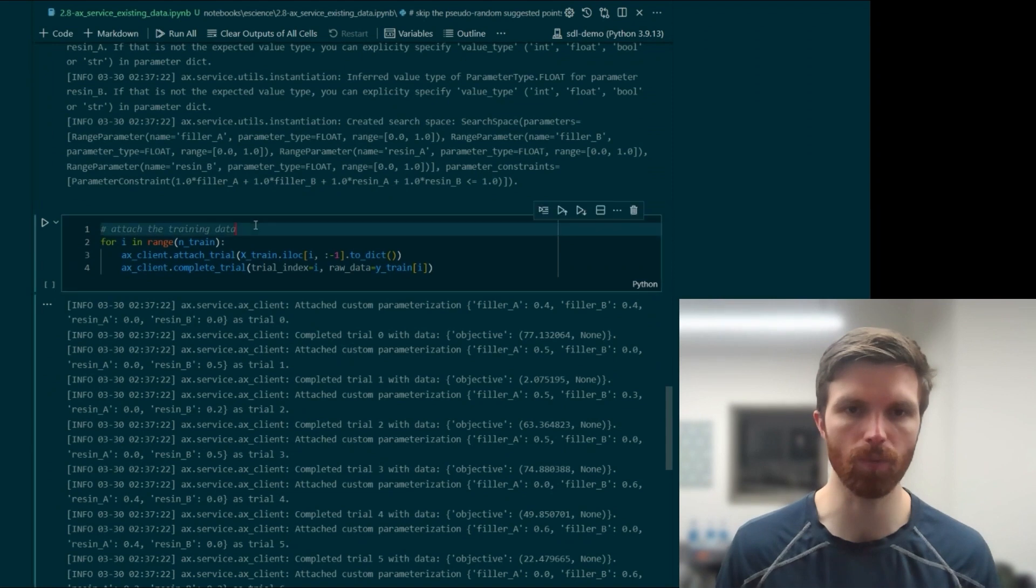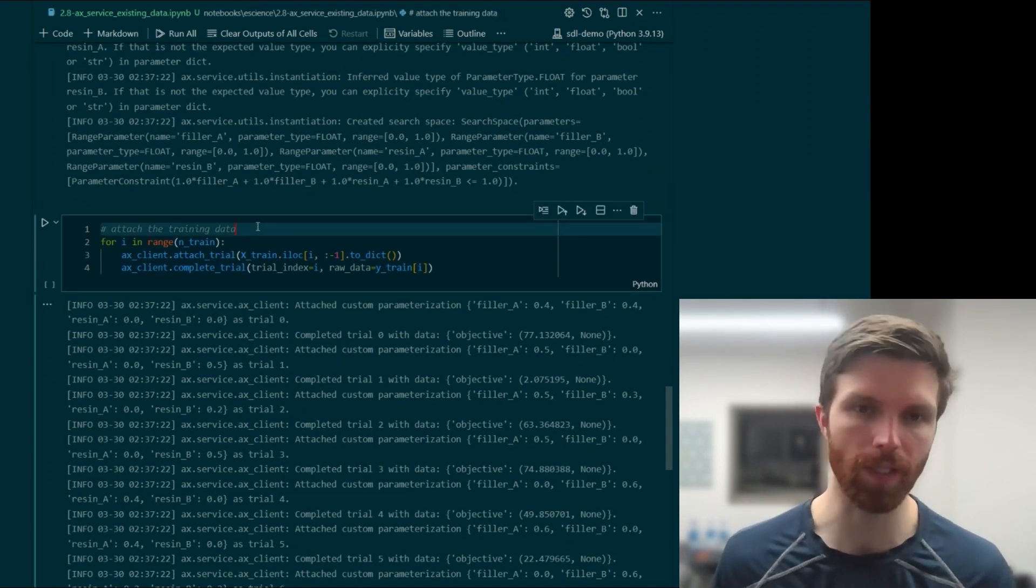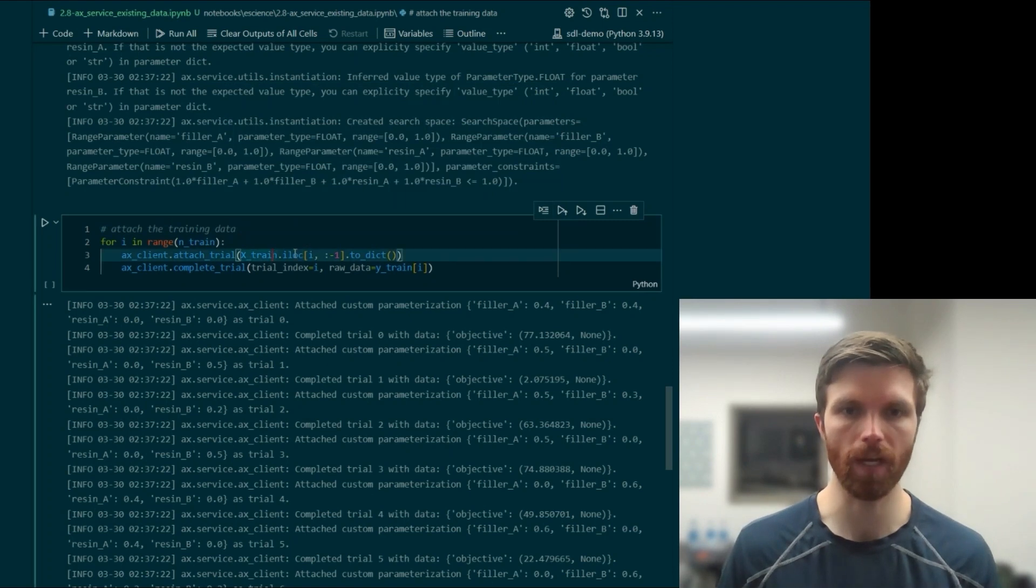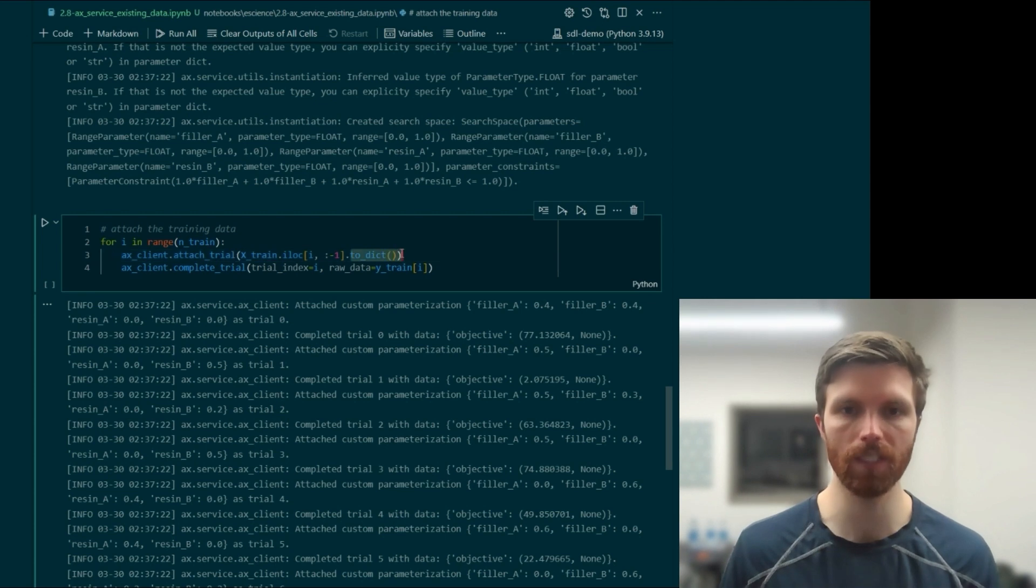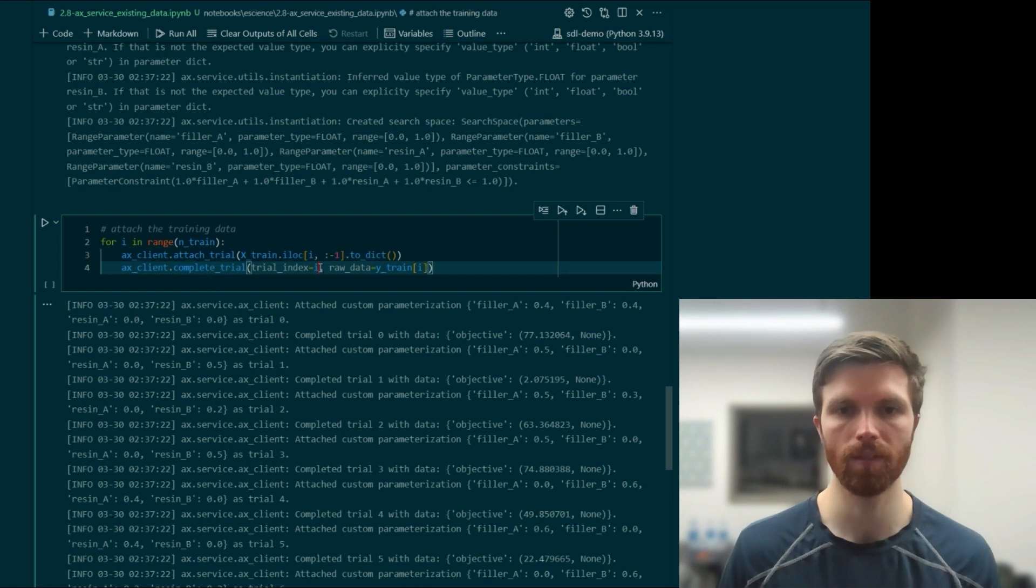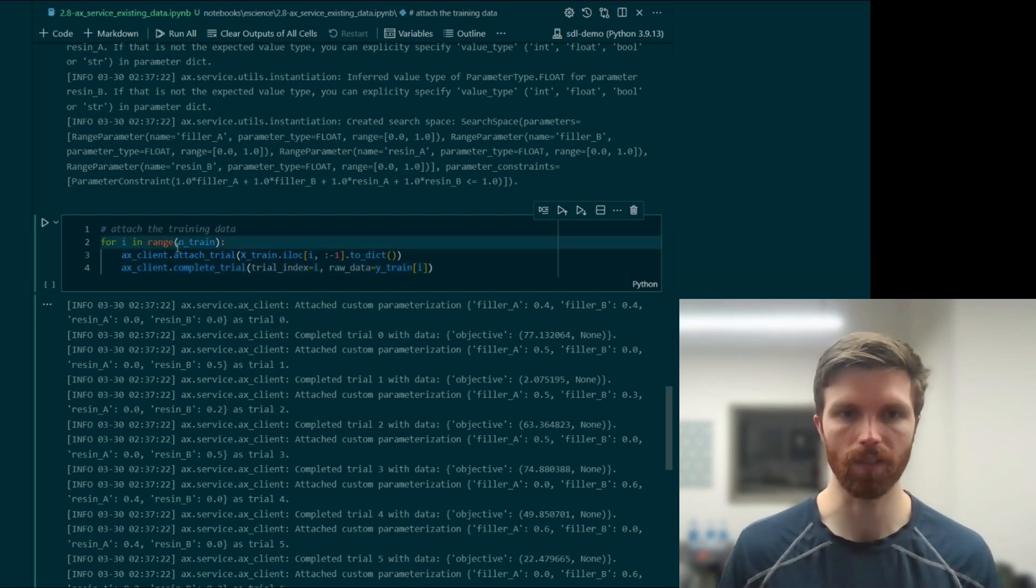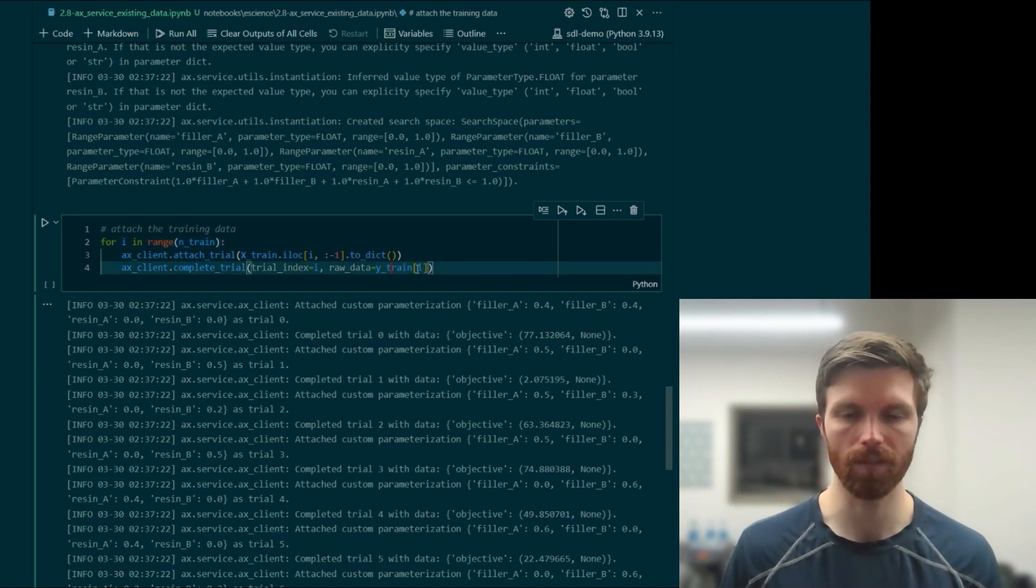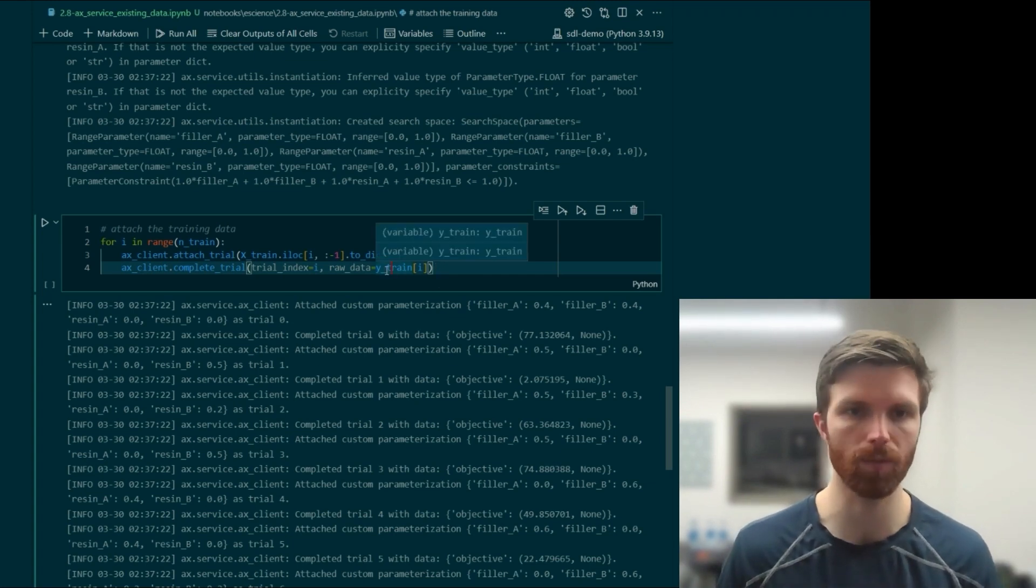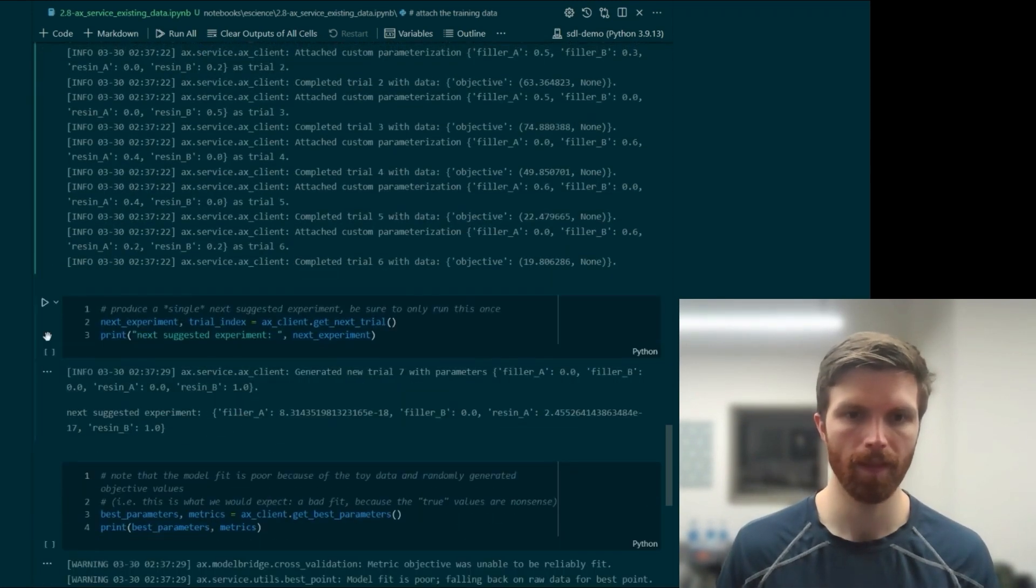From here, this is where we'll attach the existing training data. So we'll loop through and grab each row from our training data frame, convert it to a dictionary. We'll attach the trial, and then we'll complete the trial, passing the trial index, being just the enumerated values, and then our raw data, which is the training values, these scalars sampled from the y-train variable.